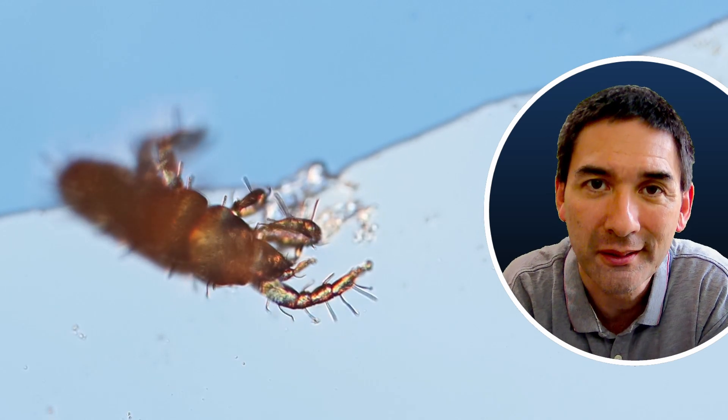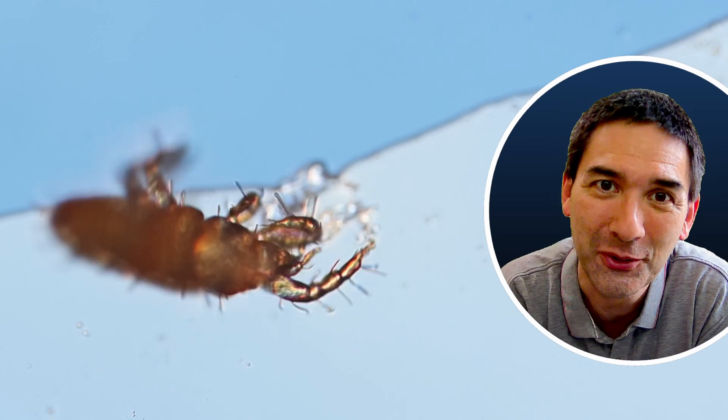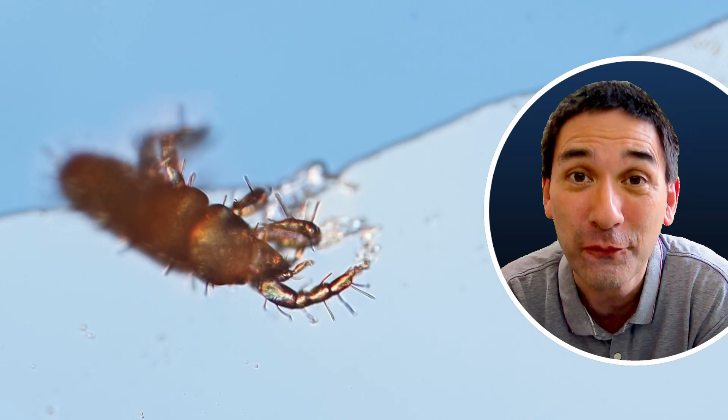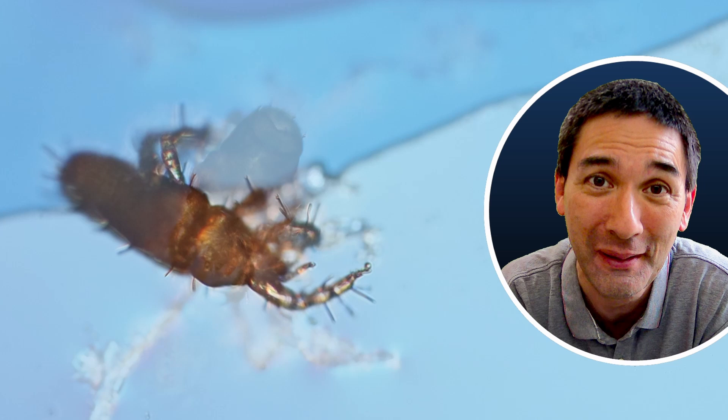This here is a mite under the microscope, and today I want to tell you the story of how I accidentally, without knowing it, ate a few hundred of these microscopic mites.